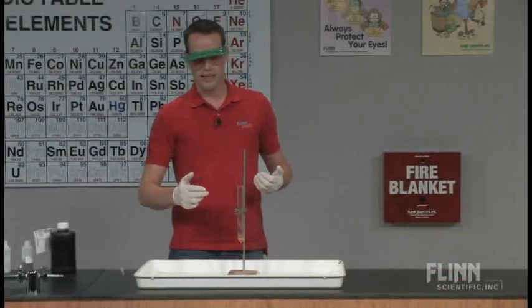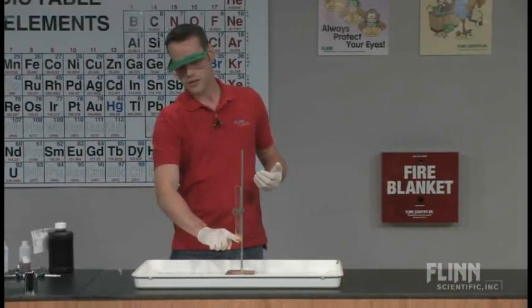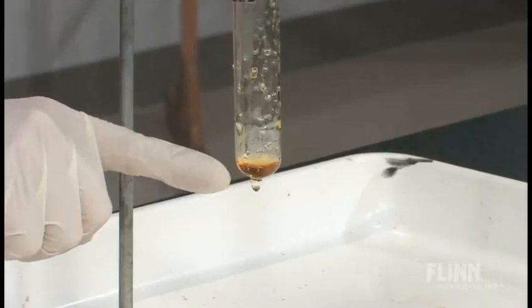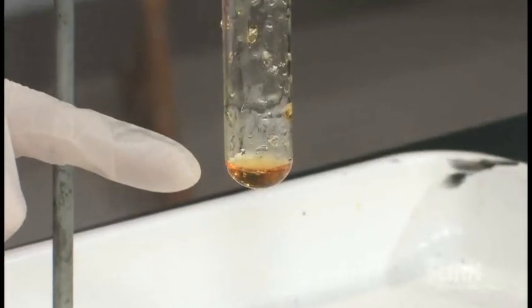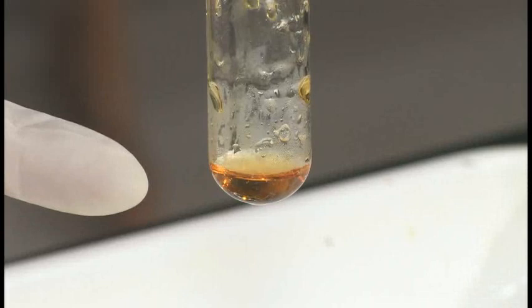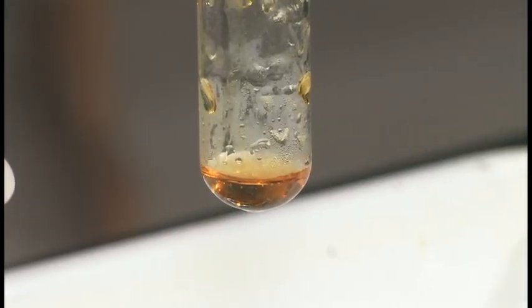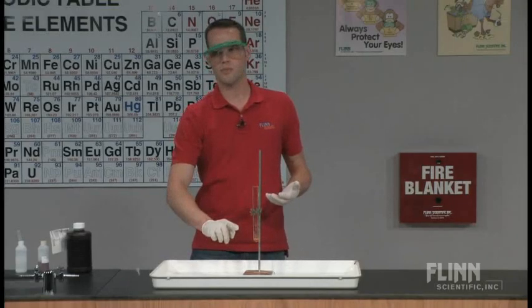And then the interesting thing is that if you look in the chemical splash tray and you can see a little bit of it down here, there's still that yellow color from the iron chloride solution beforehand. Now my students usually remark that this is a little bit lighter than it was before.